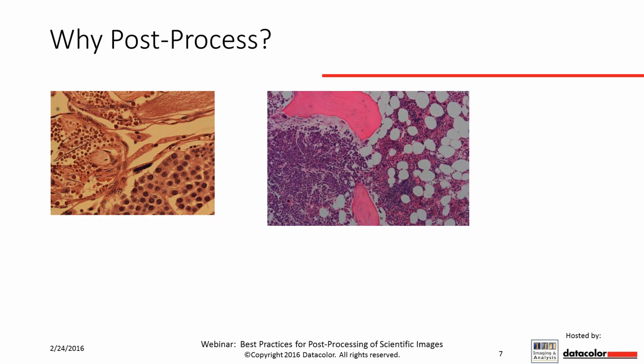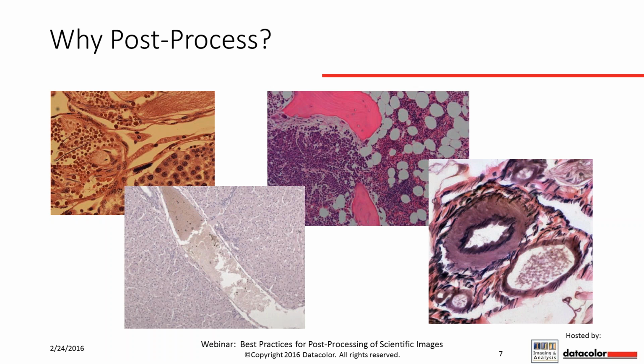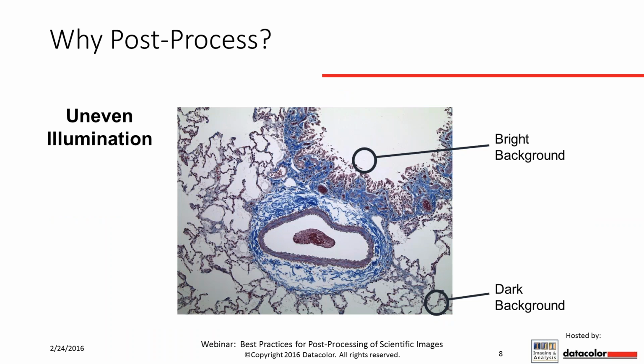If an image is too dark, you'd certainly want to brighten it. If an image lacks contrast, you would certainly want to adjust the contrast and brighten a muted color. And then finally, you would want to correct colors if you feel that they are inappropriate. But again, that's something that's subjective, but we'll talk more about that.